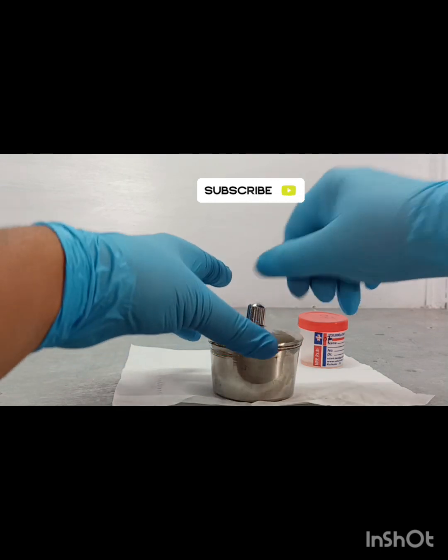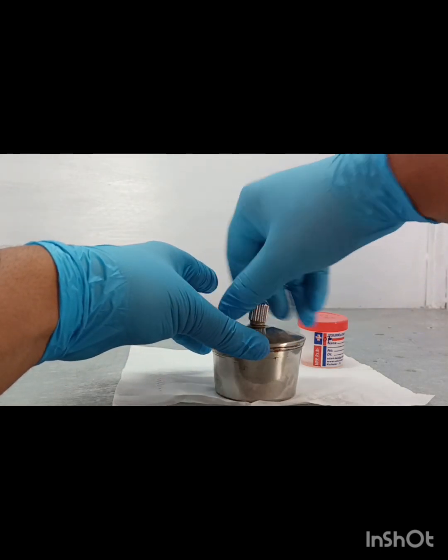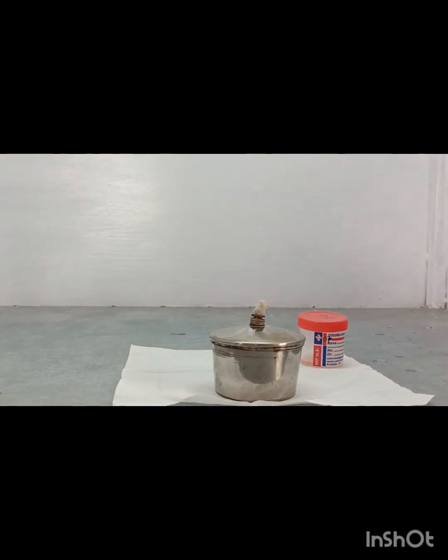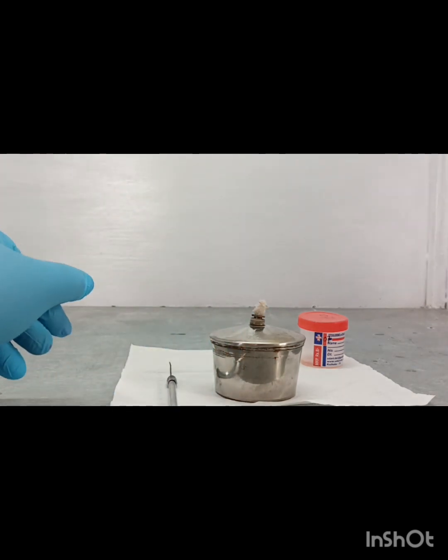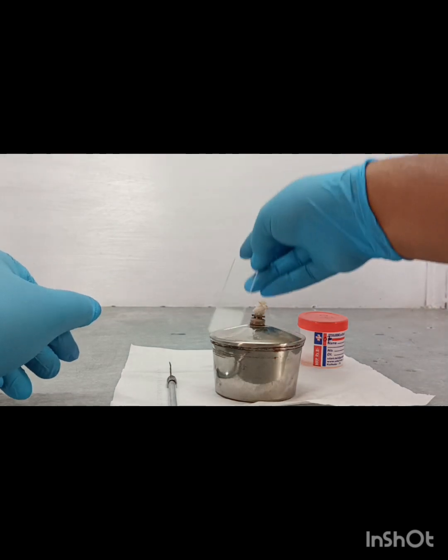This is a spirit lamp. This is the nichrome loop. Okay, what will happen at first?